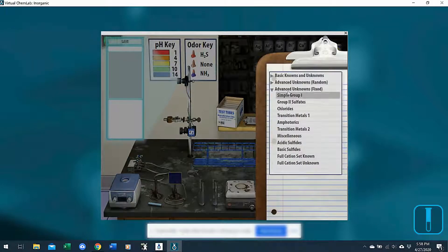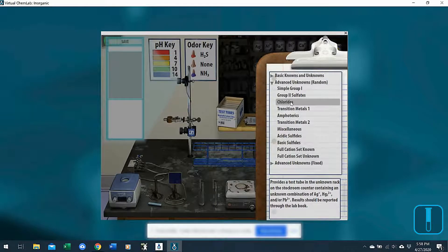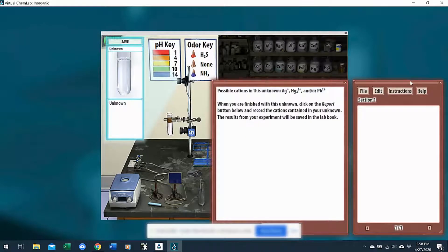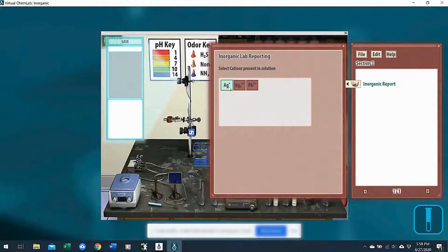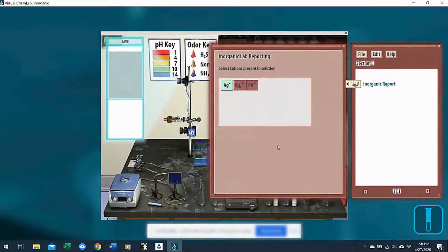The last way from the clipboard is the advanced unknowns random category. Students choose one of the groups — it tells them the options of what could be in it — but the way they determine what's in the tube is with the lab book. When they click on the lab book, they can click the report button and select the buttons for whatever they think is in that tube. They click submit, and based on the colors of the boxes, they know if they've determined the cations correctly: all green means right, all red means wrong, mixed means some right and some wrong. A report is then generated on the side where students can write notes on the procedures they did. They then click file, save, and save the file with whatever code you tell them to use. They can send you this lab book file through your LMS or email, however you communicate with your students.